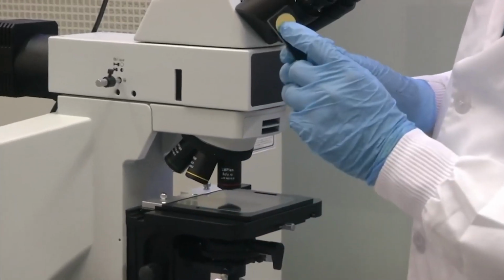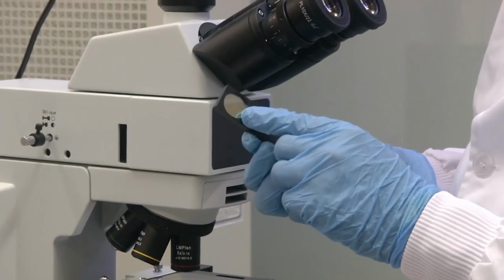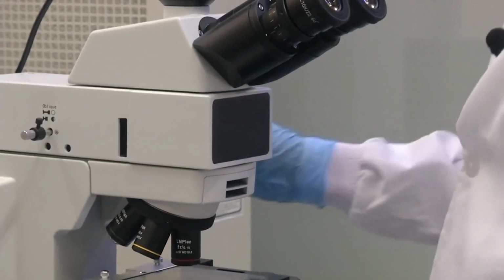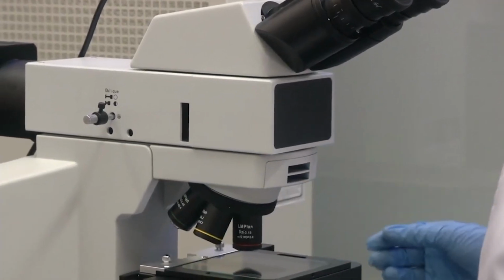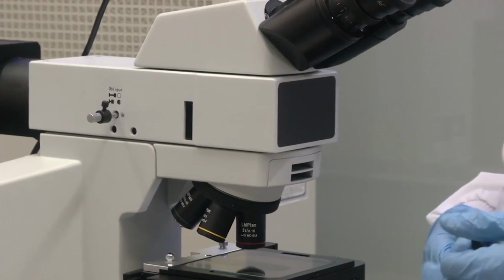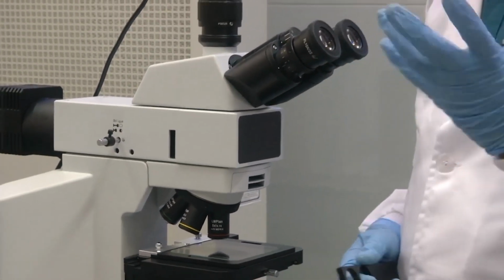Here if you can see, we have put a filter here. I think you can see a small color difference. So that is one filter that is put. So these filters you have to insert. There are places where you can insert these filters into the microscope and they will come in picture. So suppose you want to do fluorescence imaging. So what is fluorescence? Let us say you are studying some sample.